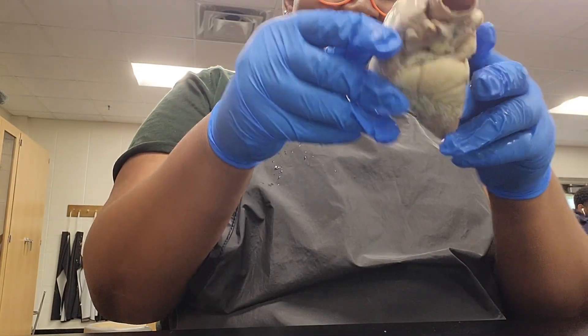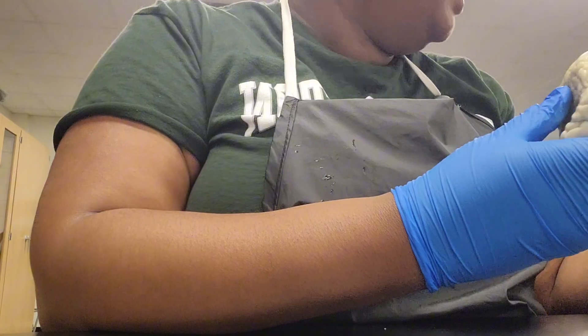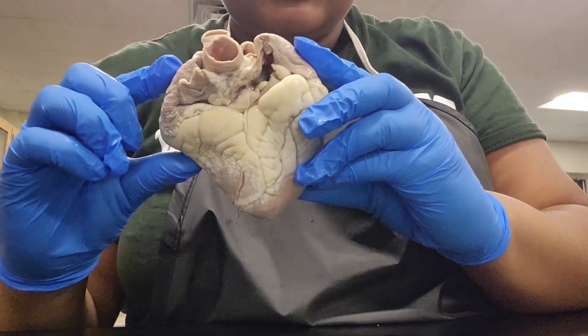Why is this dripping so much? I like my cheese drippy — I like my heart drippy.